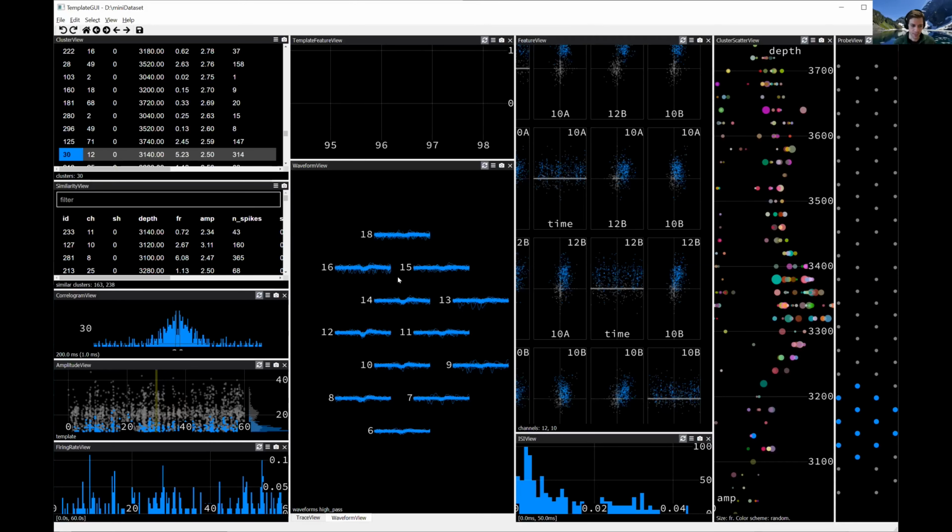And there will be more neurons that could look similar to this because you just don't have much detail in the spike waveform and it's close to the noise. Okay, so high amplitude is better. Second thing is the autocorrelogram should be clean, or the ISI view should be clean. Again, these are almost the same thing.